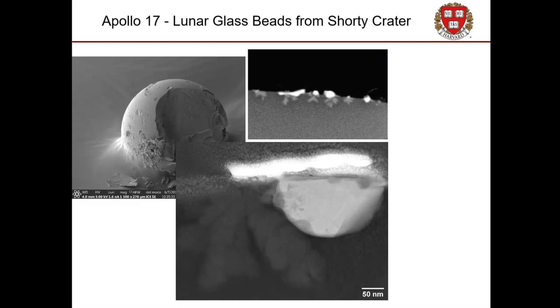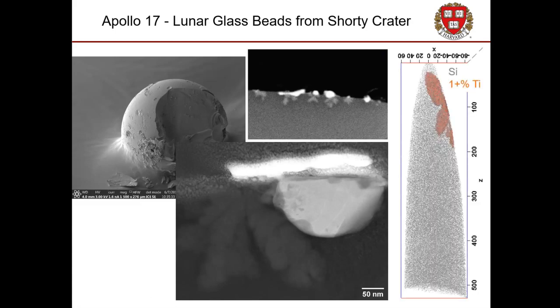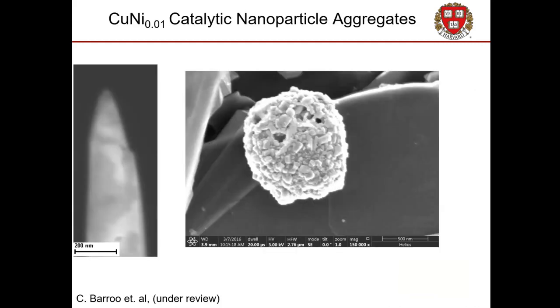And their composition and formation mechanics were not well understood, so we've taken these apart and atom probed them. It turns out that these dendritic structures most closely match olivine again. They're a titanium-rich silicate, and they have very rounded edges on them, which has a bunch of interesting implications for how they formed and how they nucleated.